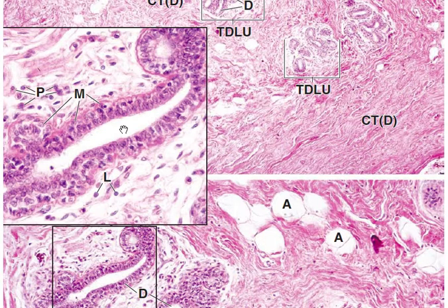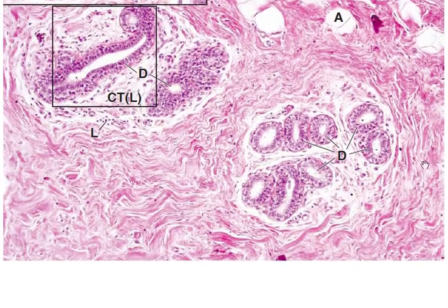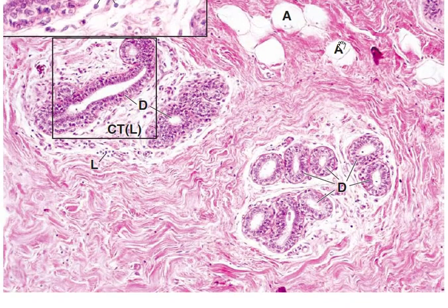In contrast, although cell types in the dense connective tissue may also be diverse, a simple examination of equal areas of loose and dense connective tissue will by far show fewer cells in the dense connective tissue. Characteristically, dense connective tissue contains numerous aggregates of adipocytes, like this here.